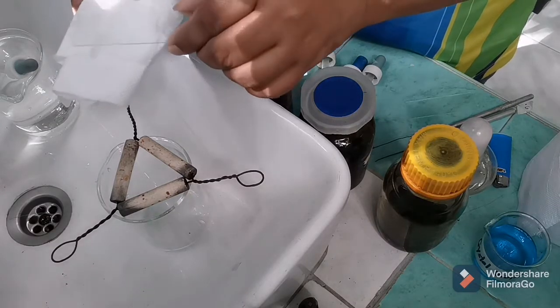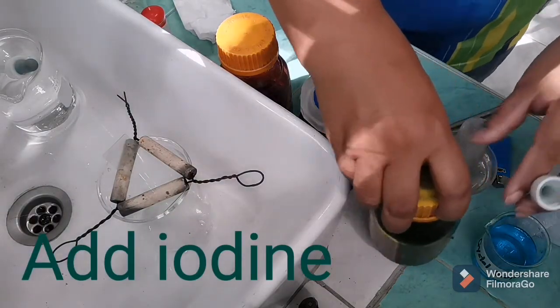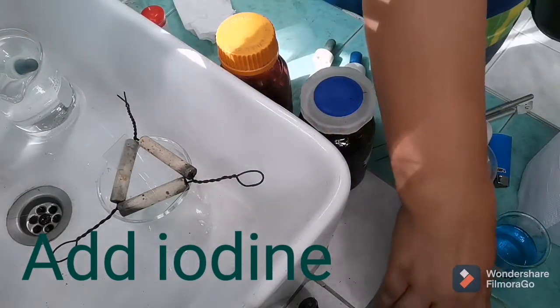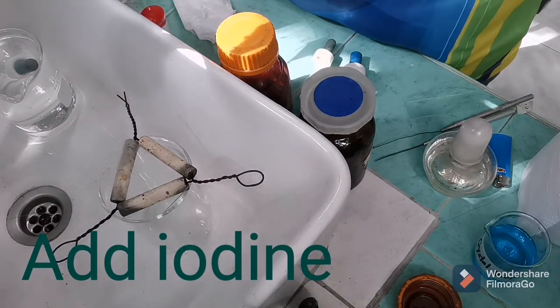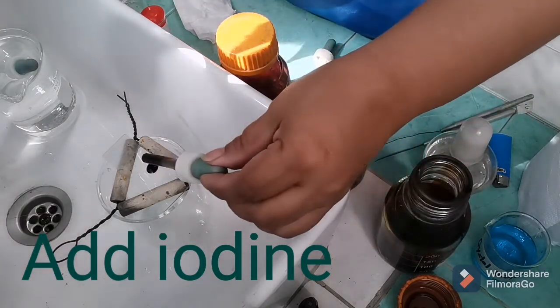Next here is already the addition of iodine. Okay, this is the iodine. And then, just the same, I will be flooding the smear with iodine for another minute.